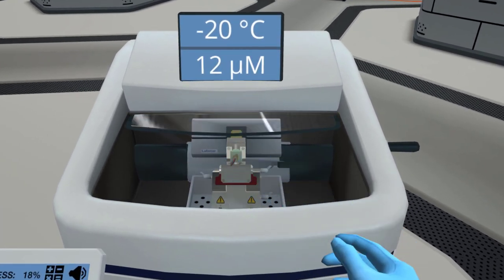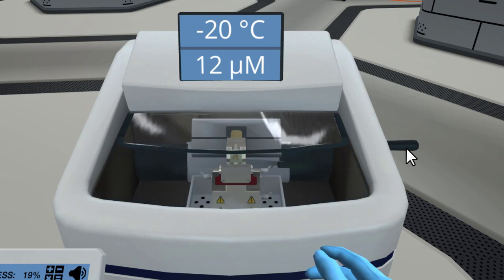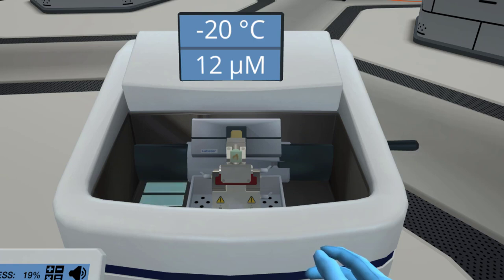Place the muscle in the cryostat. Click on the handle on the right side to start slicing the sample. Nice slices! You can find them on slides just to the left in the cryostat. Click on the slides to pick up your thin slices, also called thin sections.